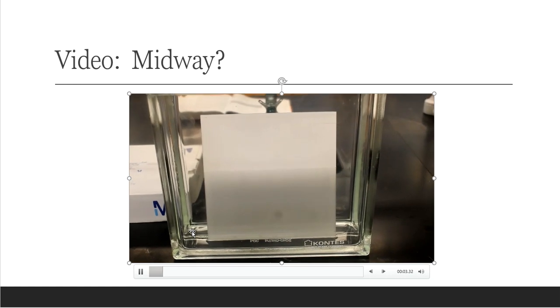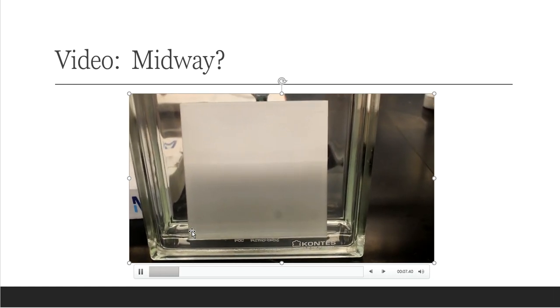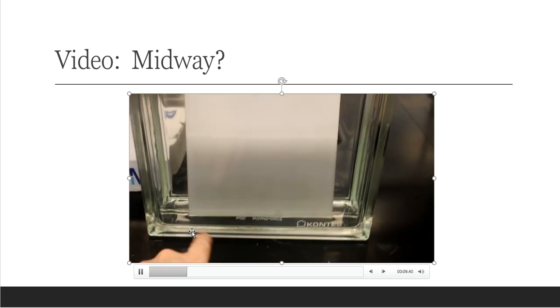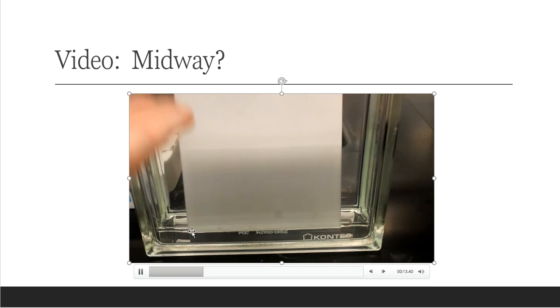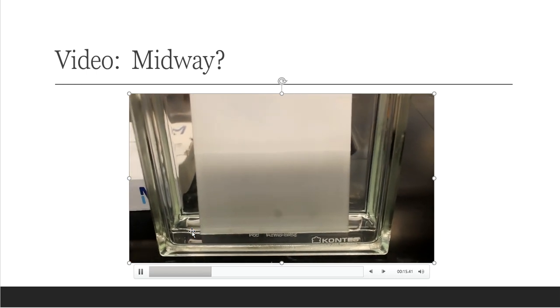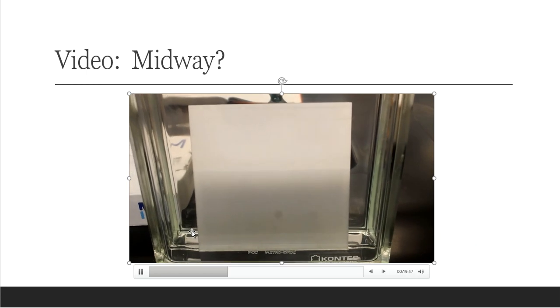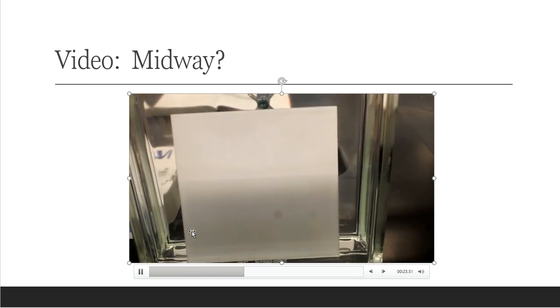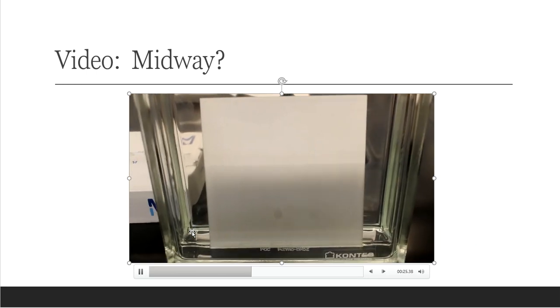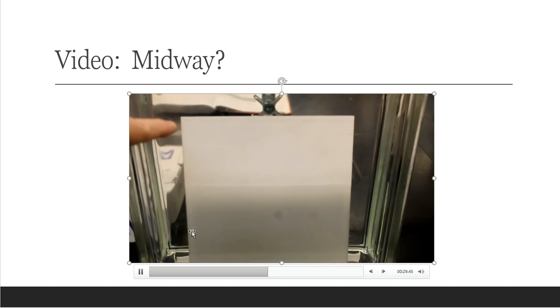Okay, so what you're seeing right now is the TLC plate in the TLC chamber, and it's beginning to suck up all of the liquid that's down here in the very bottom. And in the beginning, it goes super fast, right? You would think that this process would only take 5 minutes by the time it reaches the top. But the problem is the capillary action. Over time, as the plate sucks up more and more liquid, it takes slower and slower to get to the top of this plate.